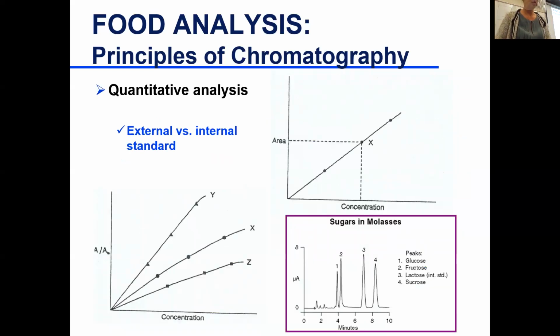So, two important things I want to talk about, and it relates to a question you have in one of the lab reports. I don't remember now which one. But what you have here, external versus internal standards. One thing you need to get straight. Without an external standard, you cannot quantitate. You need to have an external standard.